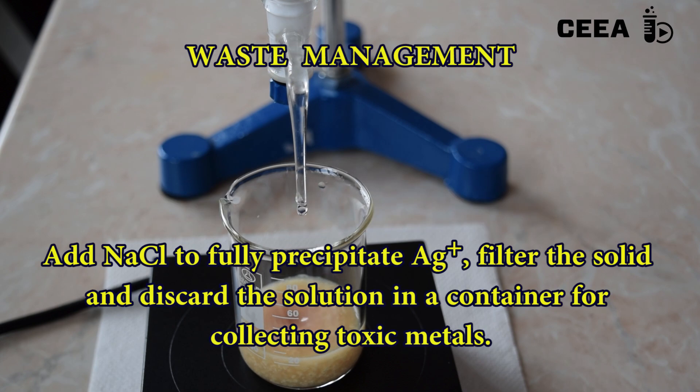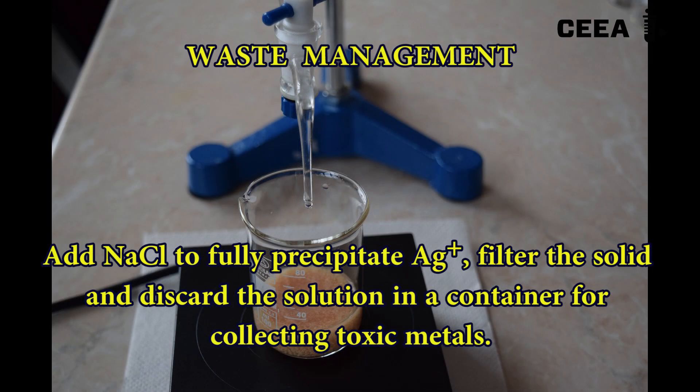To discard the solutions add sodium chloride, filter the precipitate and discard the solution in a container for toxic inorganic waste.